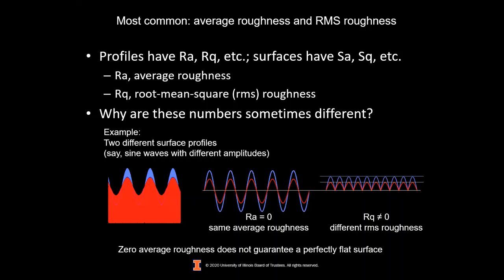It gets a lot more reliable if you're up in the tens to hundreds of nanometers, but because this is not your surface feature height, but instead an average of the square of it, and then the whole thing is square rooted, it ends up being a smaller value that you can measure.